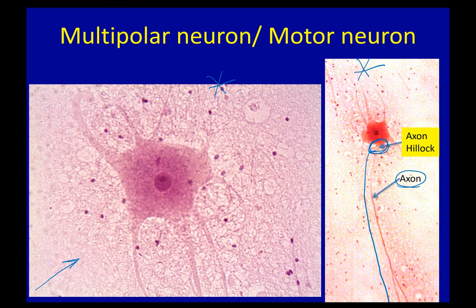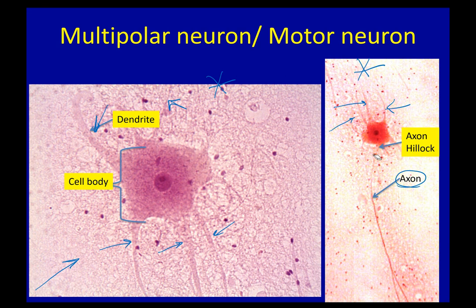Now, taking a look at the zoomed picture, you've got the cell body, right? And technically, I can still point that out over here. That is still the cell body. You have the dendrites, these short extensions coming off of the cell, which again, you can still see over here. You can still see these short extensions coming off of this cell body. It's not like you can't, okay?